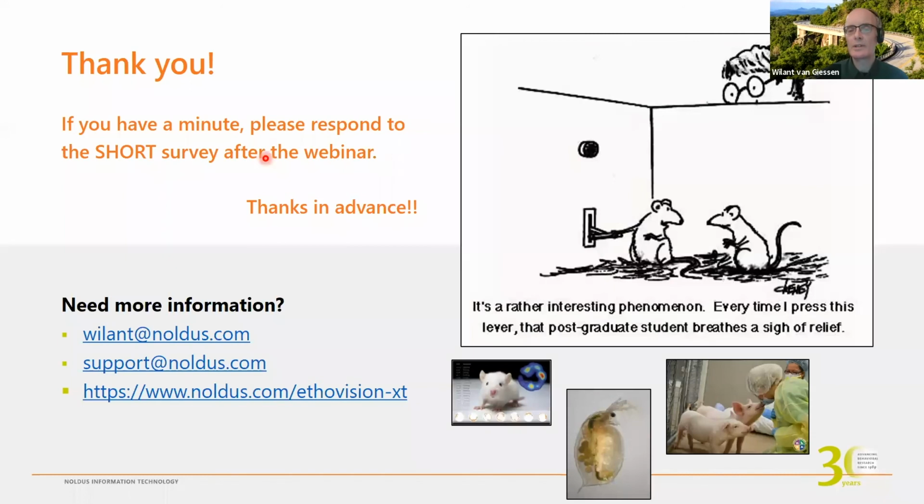Of course, what you want to achieve is even lighting and everything constantly the same, so you can stick with just the one detection setting. It saves you a lot of time later. But that's not always achievable, obviously. That depends on your setup. Hopefully that answers that question.